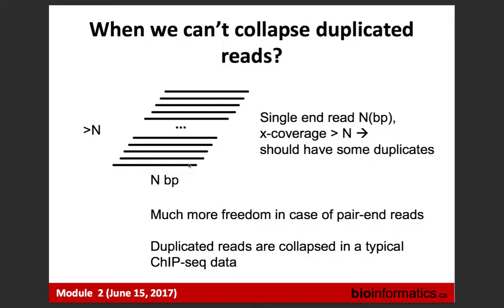This is the first reason. And then, for example, if we're looking at whole genome shotgun and we are calling SNPs, and we have one mistake in this read, then we will have wrong SNPs there again, because we'll have enough coverage and we will call it homozygous. So this is a general comment. Duplicates are removed from histone ChIP-seq data for that reason, right? Because you're trying to estimate enrichment over background. So they should be removed.